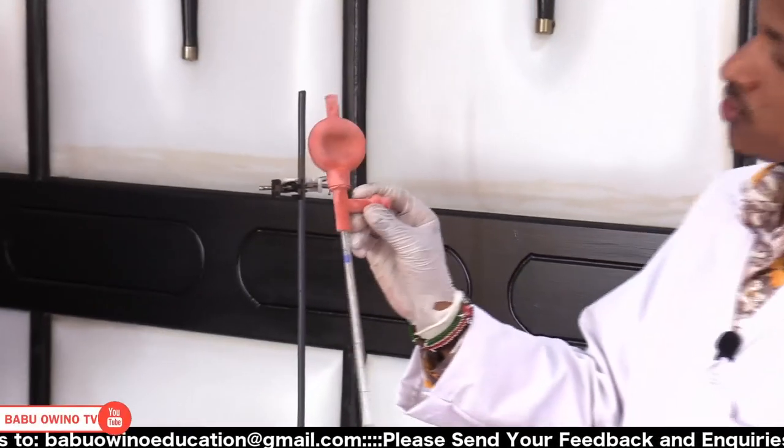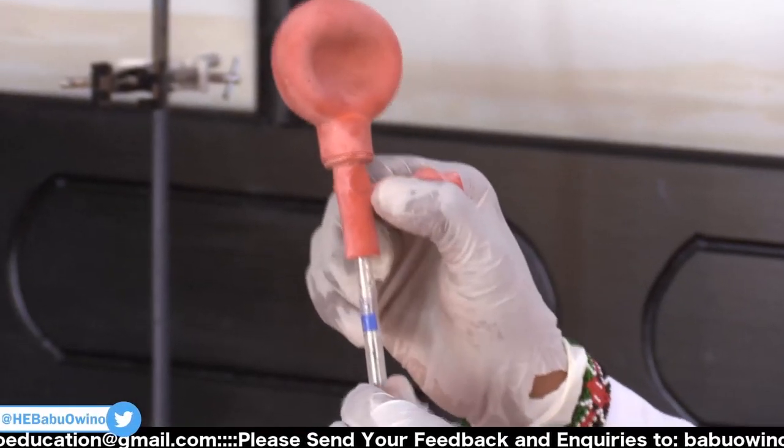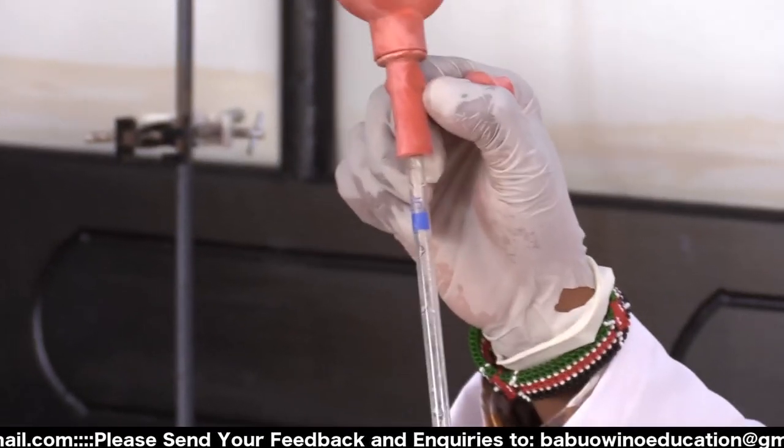And then there's also this part of the pipette sucker. This is used to release the solution in the conical flask.